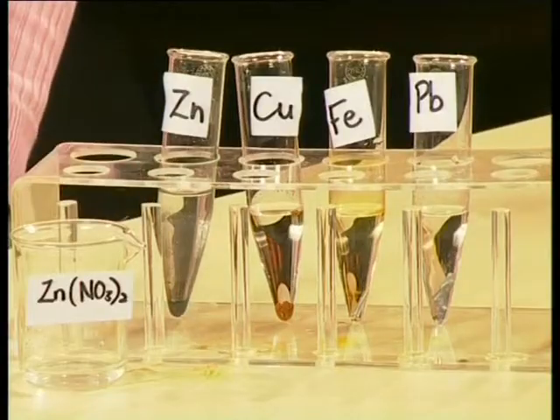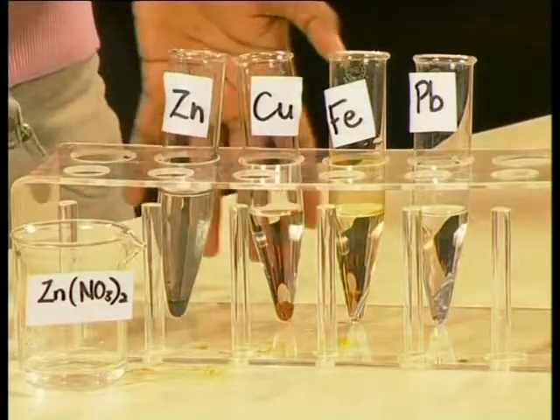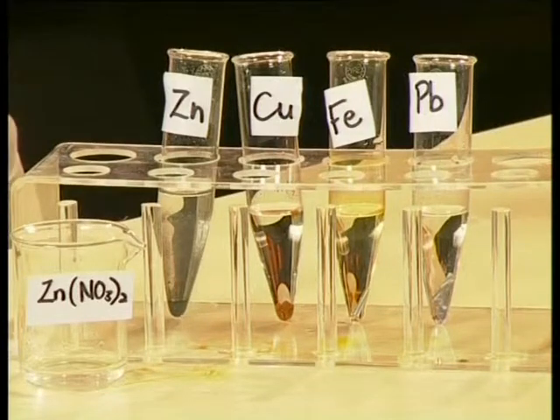Can you see how important it is to have the correct ingredients for each experiment to make sure you get the best results? Speaking of results, John's right. We should be able to observe the results from our experiments now. Remember to have your table handy to note the results down. You should remember that our zinc nitrate solution was clear and colorless. Let's see if this changed. There seems to be no change in any of the test tubes. The solution is still colorless and there are no changes in the appearance of the solid metals.